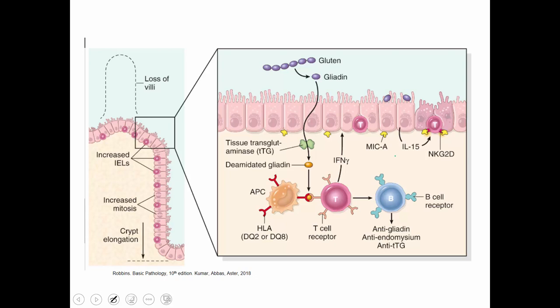Here is a case, which you hear in pathology, where you have some epithelial cells of the intestines. And you see you have these nice microvilli. But in some cases, you'll have patients that have allergies to gluten. And what happens? They become malabsorptive. Why? Because look, on the right-hand side, you're starting to get a disappearance of these microvilli, and so they're not absorbing properly. So this is an example of celiac disease, where you have antibodies that are generated, and you get a destruction of the architecture of the apical surface. So these are really important specializations.